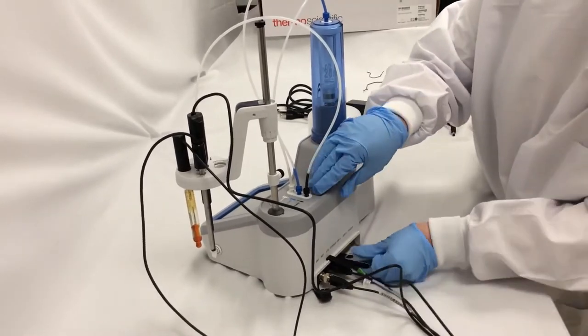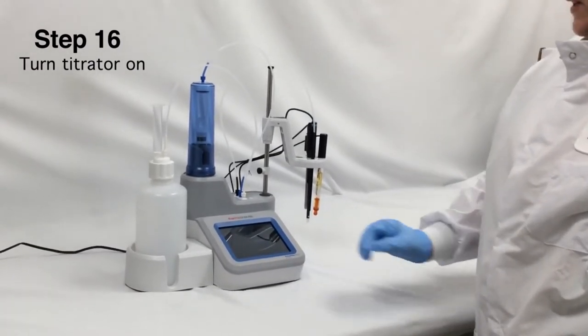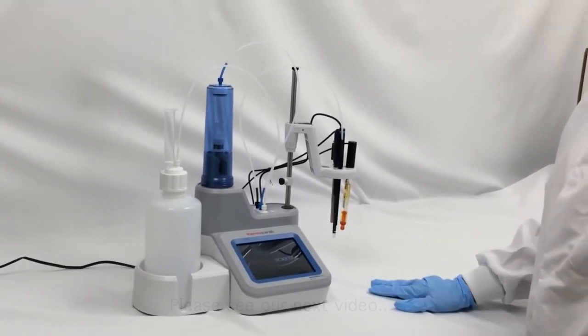The final thing is the power cord. Next, I'm going to turn my titrator on. I get a nice splash screen, and then I'm going to get the setup wizard, which is going to walk me through the initial setup of my instrument.